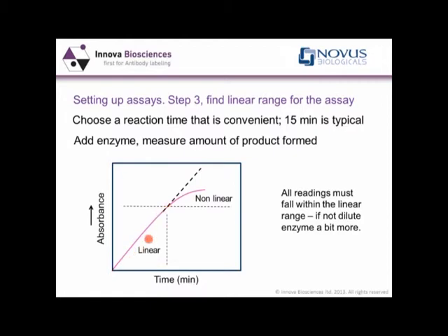And if you would like a longer assay time, so you go out like this, just dilute your enzyme a little bit more. So there's a lot of flexibility. You just have to pick something that suits you and then determine the linear range.